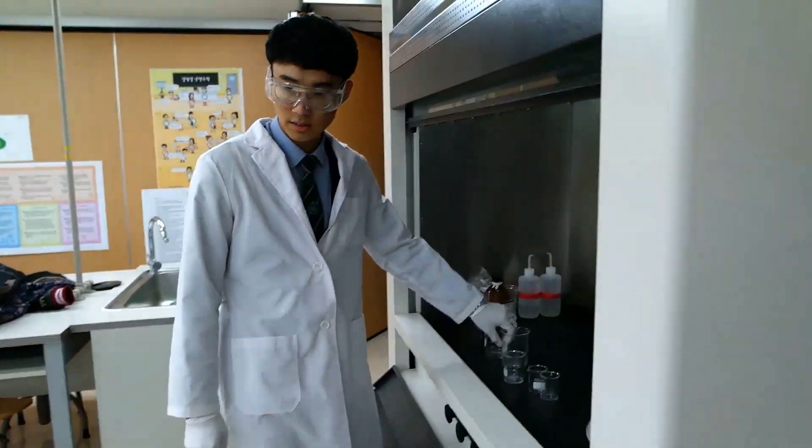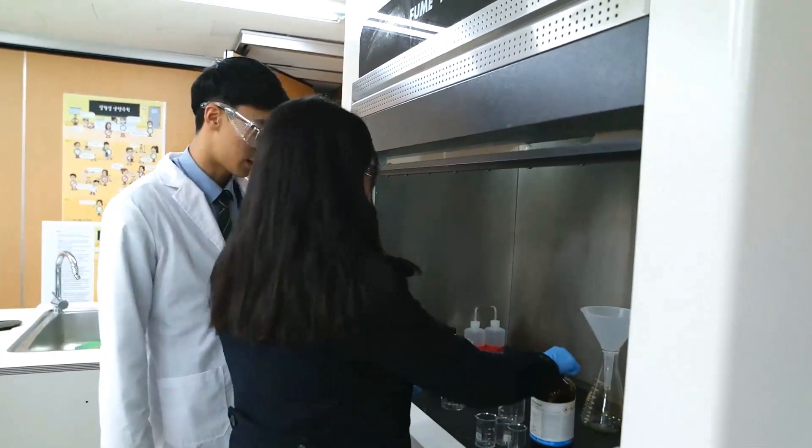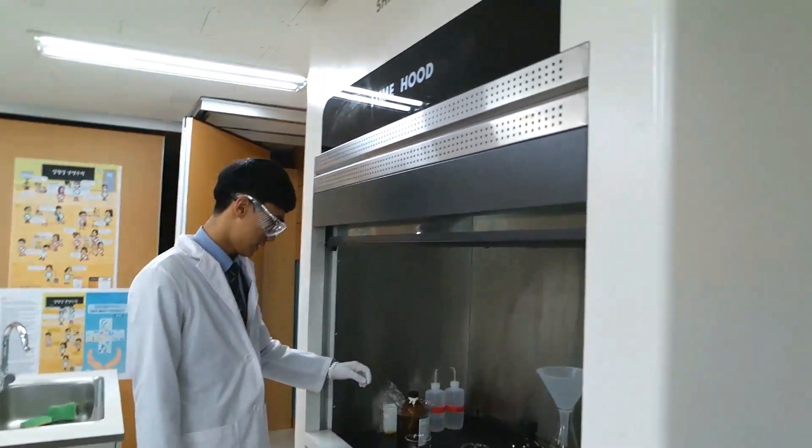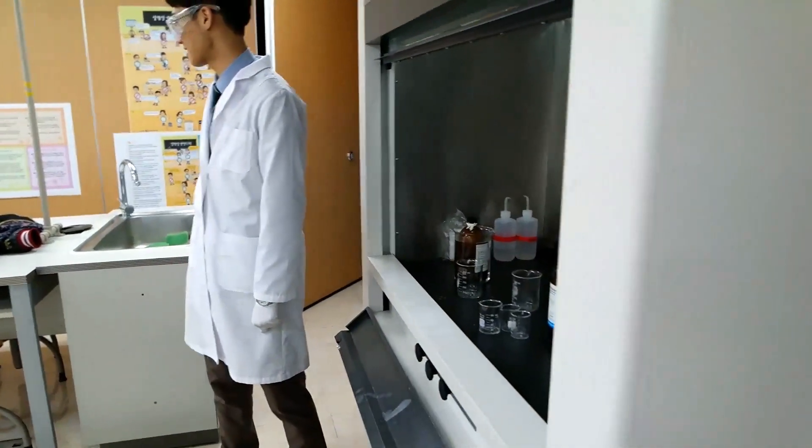Do you know why we're doing it under the hood? Hexane smells really bad. And it's toxic. Maybe you should put a mask on.